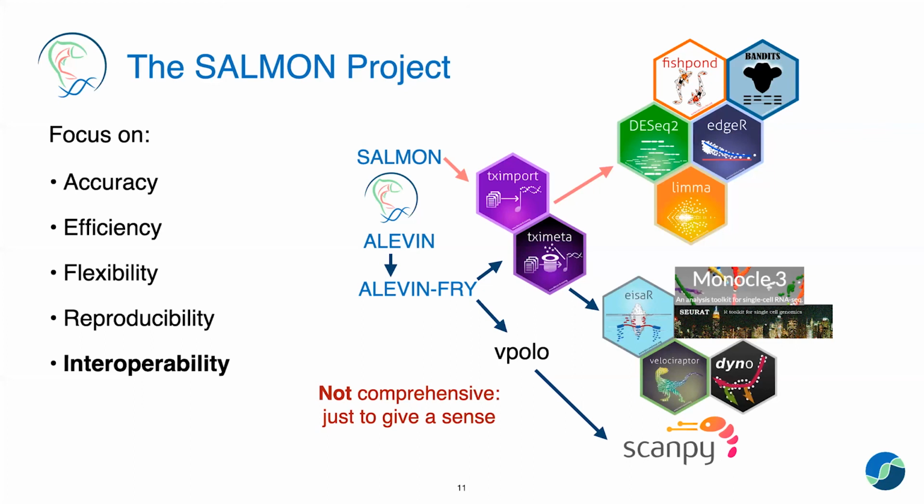And here I won't go through all of these, but there's packages for differential gene expression, differential transcript usage, single cell analyses, single cell clustering, and so on. So we really try to interoperate with all of these as best as possible.